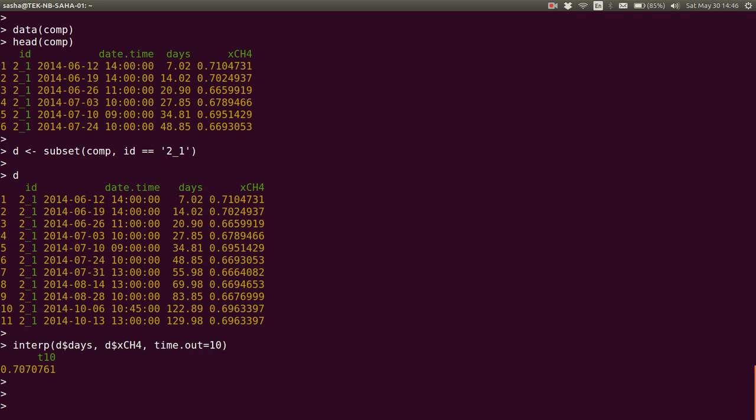The mass to vol function is for applying the gravimetric method for measuring biogas production. That is determining biogas production based on the mass loss of a reactor. So for example, let's say we measured a mass loss of 0.26 grams, 260 milligrams, from a reactor, and we know the methane content of the biogas that was produced was 0.65, that is 65% methane, 35% carbon dioxide.